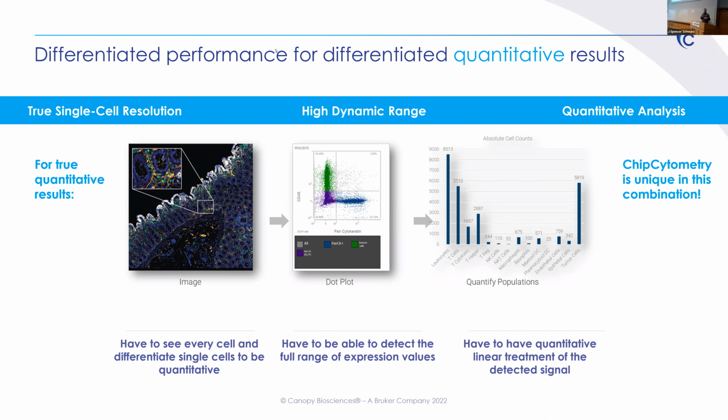Sure. Regarding putting together these large lists of markers, because we're doing it cyclically, are there order of operations issues? And there absolutely are. What we found though is that for the most part, it has everything to do with the epitopes. Some epitopes are fragile versus robust, and some just need to be at the beginning of the assay. We found that to be the major issue or bottleneck. CD19 is a real bear. If it's not in one of the first rounds, you won't be able to catch it.